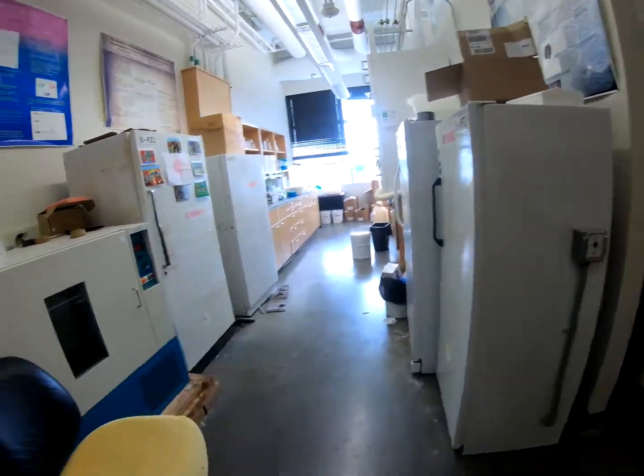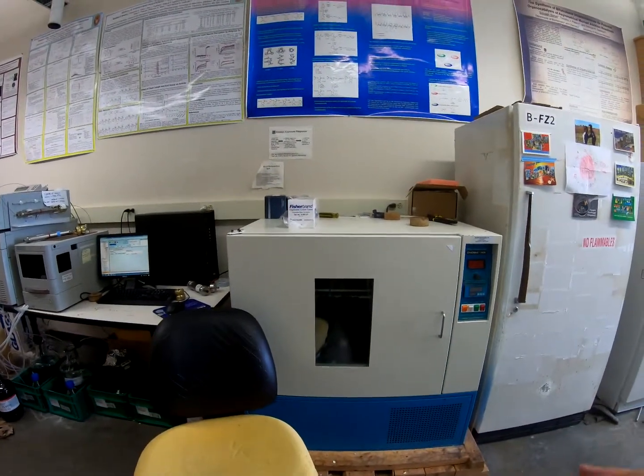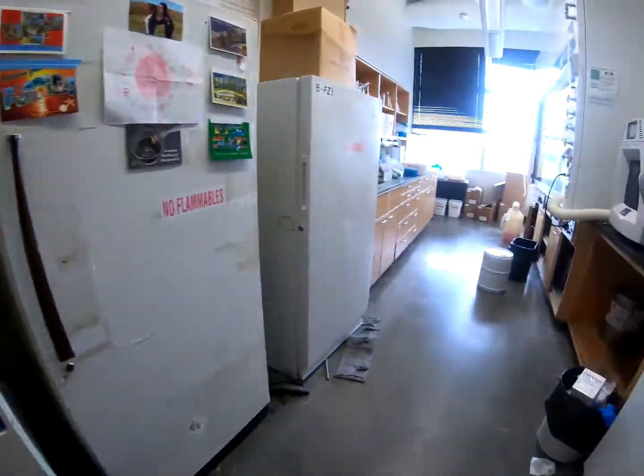So coming to the right of our UPLC and HPLC, we've got our Gyromax here, which we primarily use to just grow up cells and incubate them, that we're going to use for transformation, expressing a protein, or more of our biological purposes in the lab.